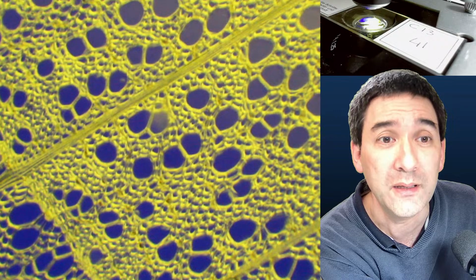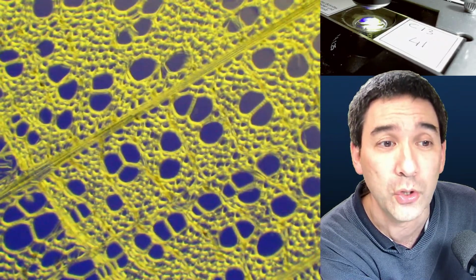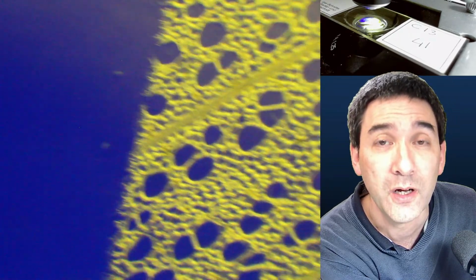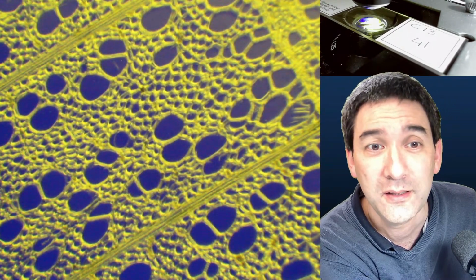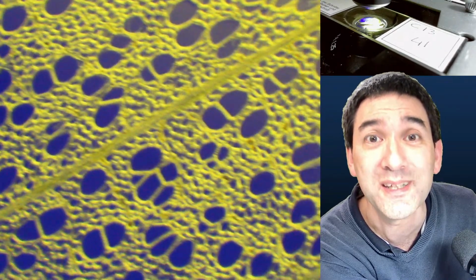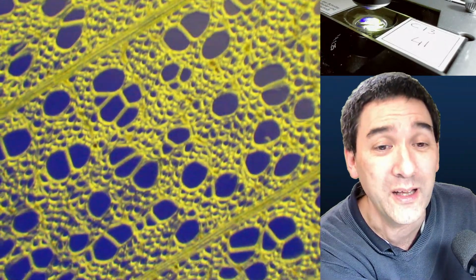Robert Hooke, a couple of hundred years ago, when he put cork under the microscope, also saw those little spaces, and he compared them to the spaces of a honeycomb. When he saw those spaces, he called them cells. Of course, at that time he didn't know what they actually are.